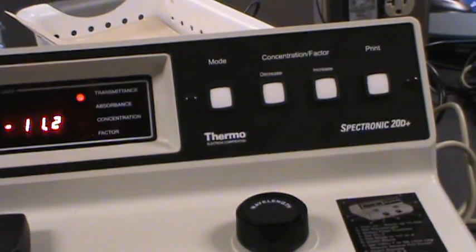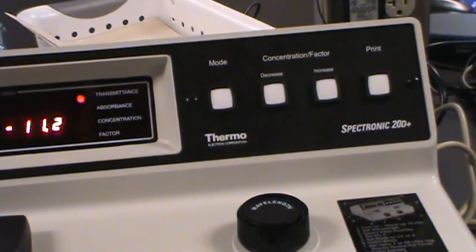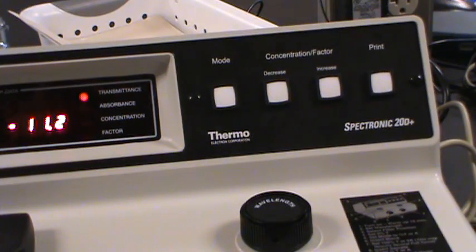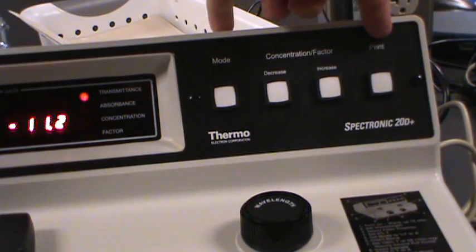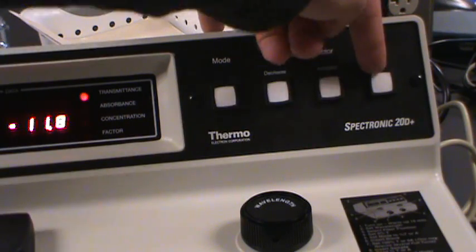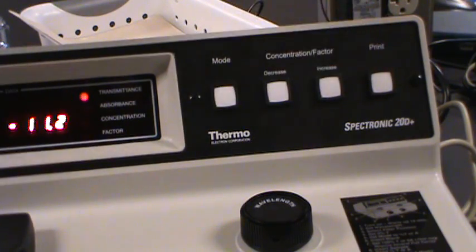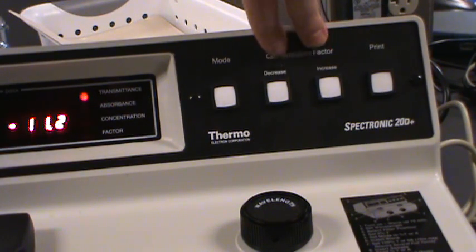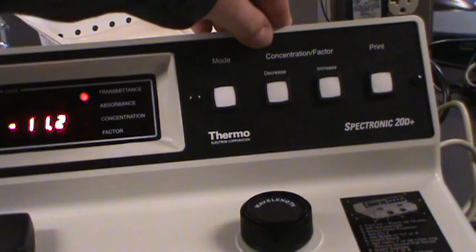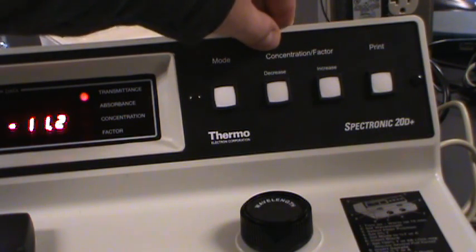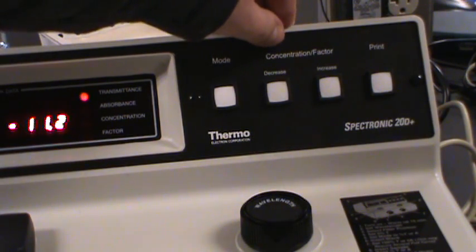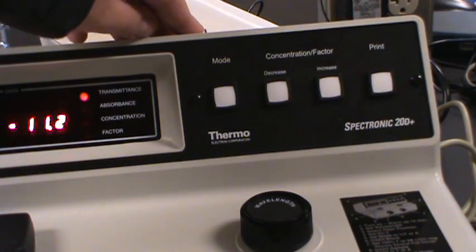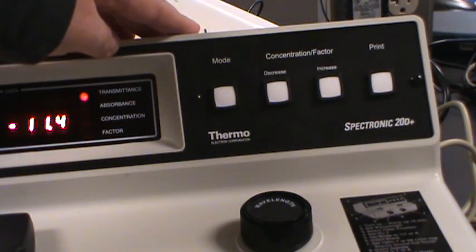Now there are a few other buttons over here. For our purposes most of them won't ever be used. There's a print button but this isn't hooked up to anything that will allow it to print. So that button doesn't do you a whole lot of good. There are these two concentration slash factor buttons. We're not using this instrument directly to determine concentration. We're just using it to measure absorbance. So these buttons aren't going to do you any good. They're not going to be used for anything.